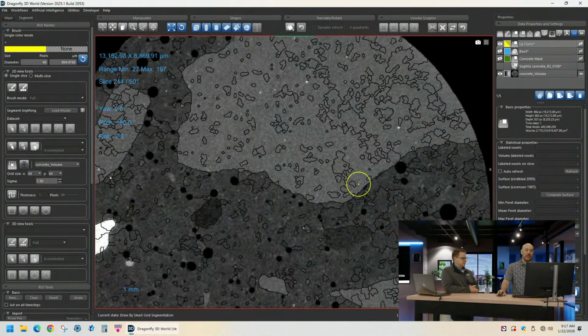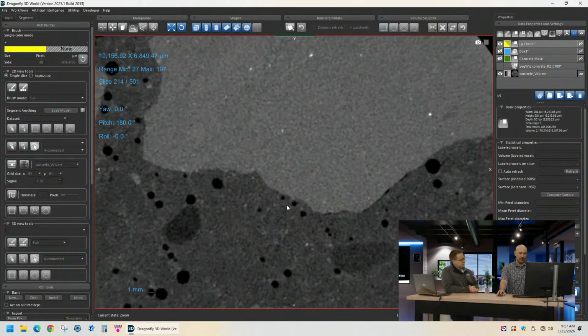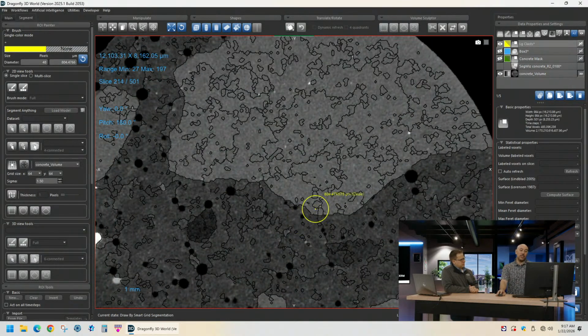It looks at the grayscale of the image that we're looking at right here, and it tries to identify and delineate, like it's making lines on what it thinks are features. And actually, one thing we are seeing, and I'm doing Control-click again, it actually is identifying these low density features pretty well.